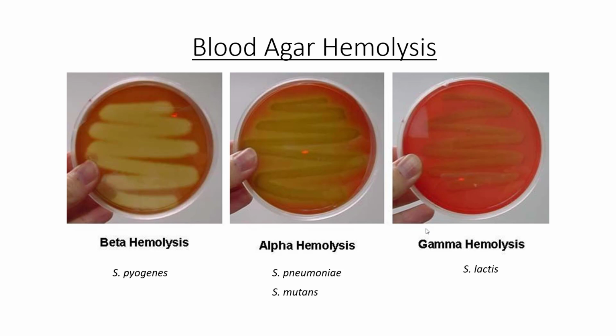Typically, non-pathogenic Streptococcus species show a gamma hemolysis pattern, which is to say no hemolysis at all. So again, if it's non-pathogenic, it tends to be gamma. Part of this lab asked you to do an unknown with a simulated throat culture. Obviously, that's not going to be done here, so you can ignore that part of the lab.